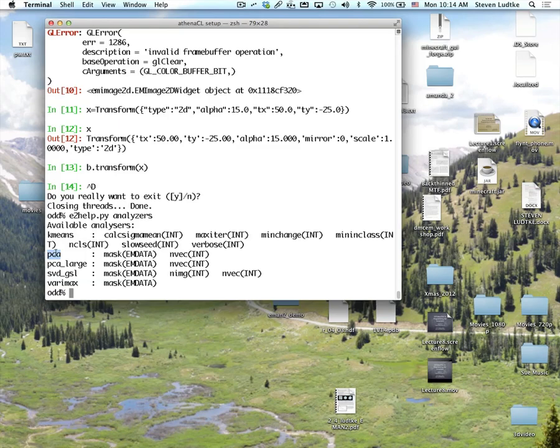It doesn't have to be noisy. It could be the same people under different lighting conditions. And I have a big stack of these images, like 100 of them, and I want to classify them and pull out just the 3 different faces. So principal component analysis would be one mechanism which would allow you to do that operation.